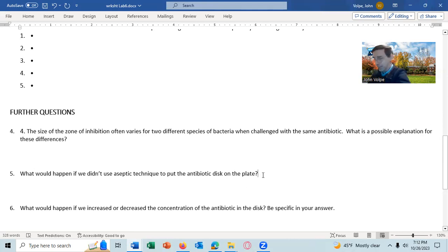And you should mention, I'm going to add this here and maybe upload it. What's going to happen to our test results? Okay. So, yeah, you're going to get probably contamination if you don't use aseptic technique. I want more than that. I want you to tell me what's going to happen to our test results.